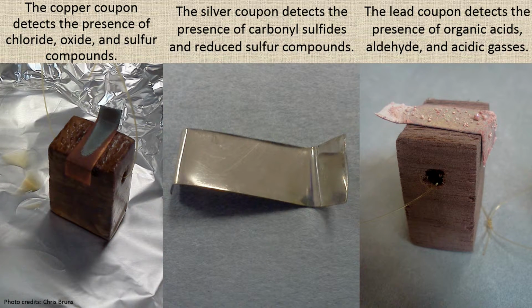In the tests above, a great deal of corrosion was created on each coupon. In cases where the corrosion is less obvious, I use a microscope to examine the coupons. Depending on the amount of corrosion present on a coupon, the material sample can be deemed acceptable for permanent use with artwork, or acceptable for a one-time use, not to be used in direct contact with artwork, and only for the length of a temporary exhibition, or not to be used, deemed unfit for use with artwork.